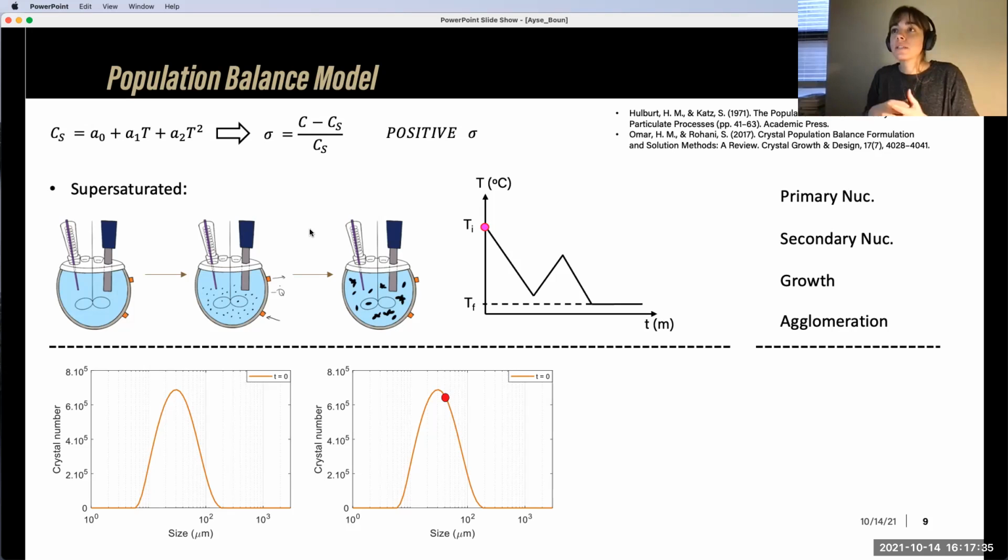So I do crystallization experiments by using the temperature difference. There are other types of crystallization like anti-solvent addition or pH change, but I always do the temperature cooling crystallization. It's like making a jam. Basically, you put a lot of sugar in your solution while it is hot, and then you cool it down, and sugar basically crystallizes out. It's basically the same thing. And the driving force is supersaturation, which is determined by the solubility curve, the solubility of your material in your specific solvent, and basically how you cool it down. So you create this concentration difference, supersaturation.